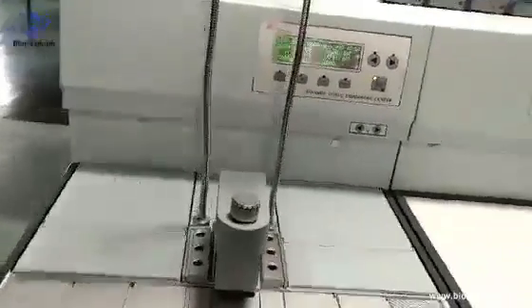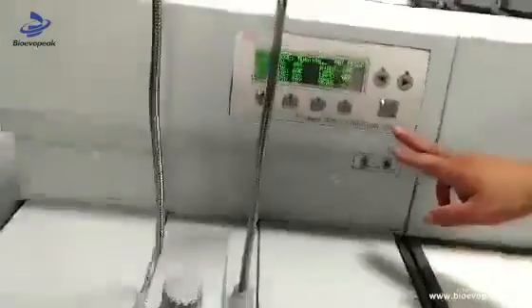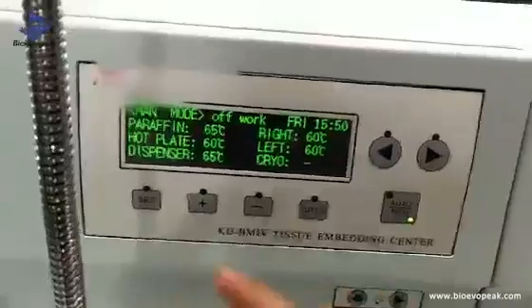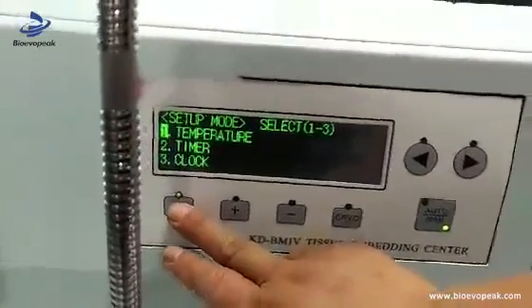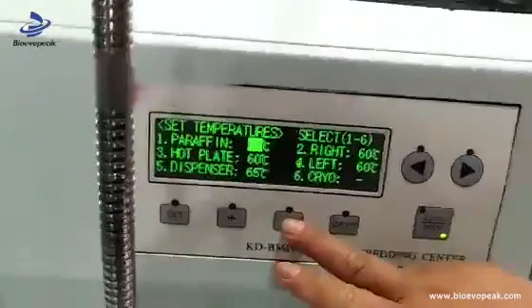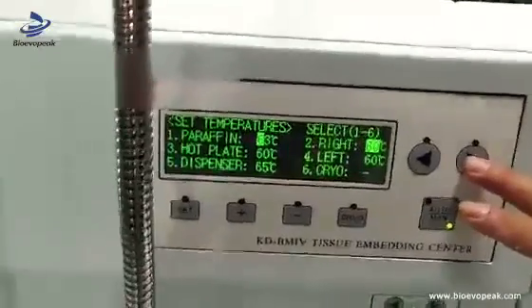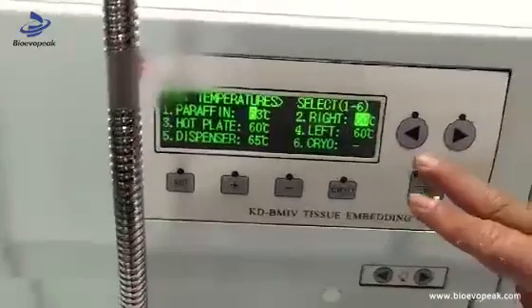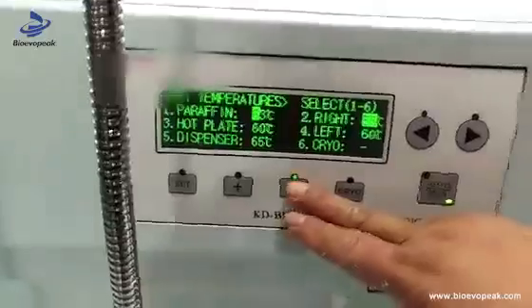Now let's go to the embedding machine. First, go to the menu mode for adjusting the temperature for each part. Set the temperature for the paraffin station, the right box, the hot working table, the left box, and the paraffin dispenser. We can set the temperature for different parts.